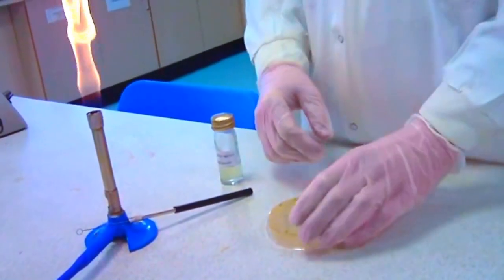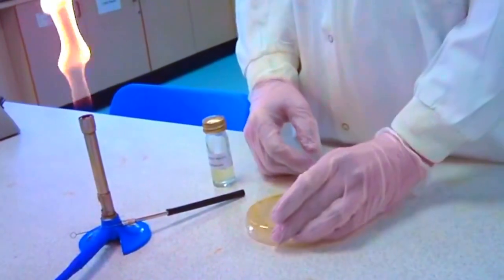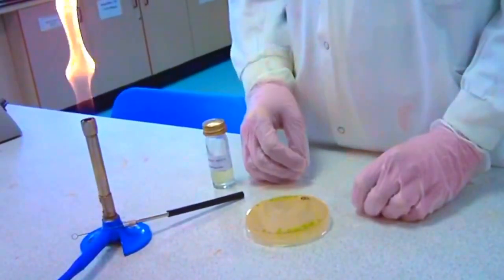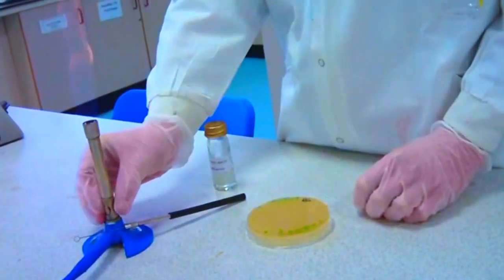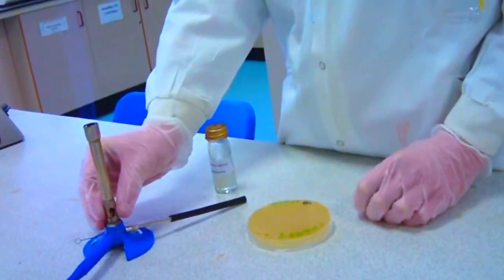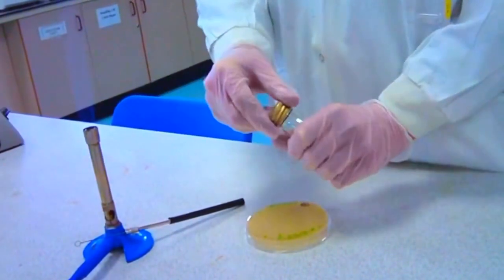Place inverted plate close to the Bunsen burner to reduce chances of contamination. Turn on the Bunsen burner. Loosen the cap of the bottle containing the inoculum.